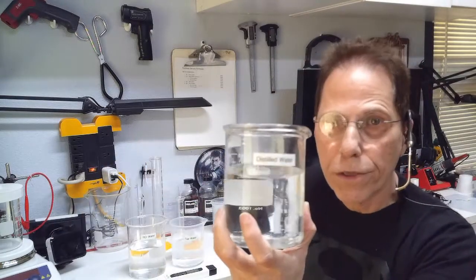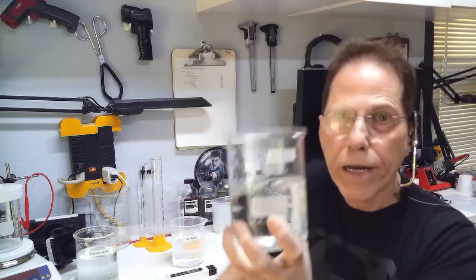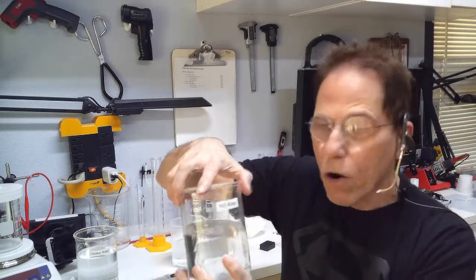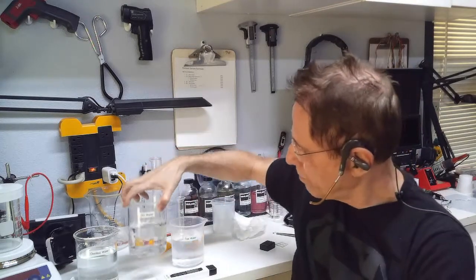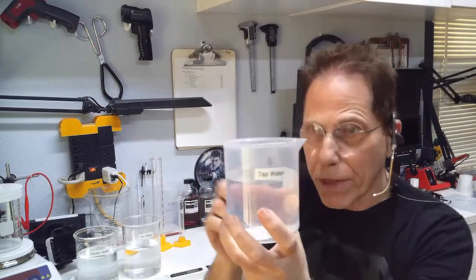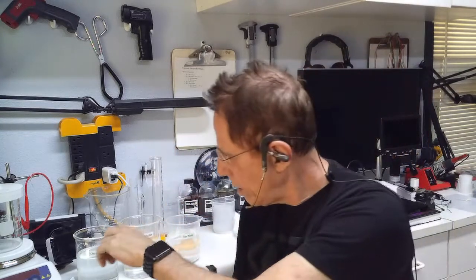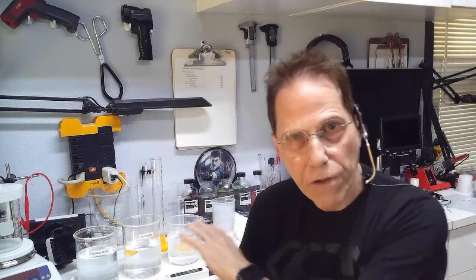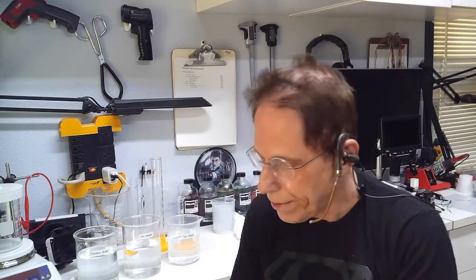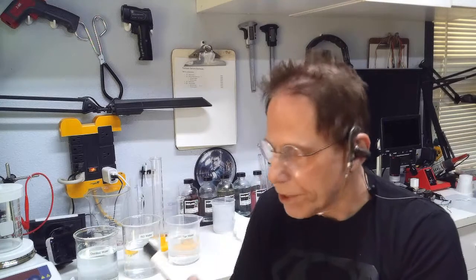I got distilled water in this beaker. I got RO water in this beaker. Now, RO stands for Reverse Osmosis. Talk about that in a second. And tap water in the plastic beaker. Now, each of these have different parts per million as far as dissolved solids that might be in there. You will need a total dissolved solid meter, parts per million meter, to tell you what that is. So I got one here.